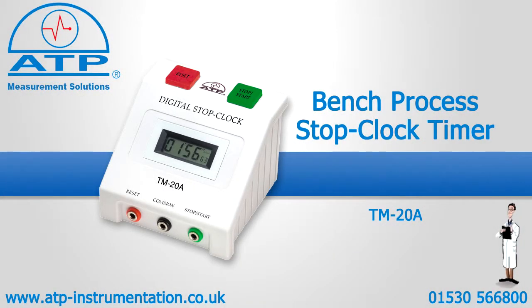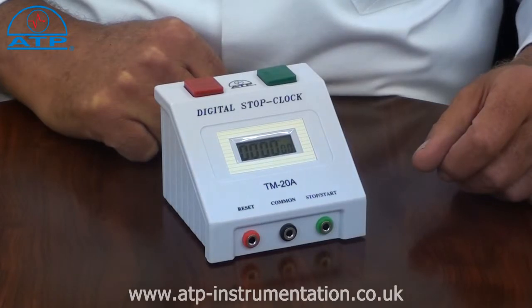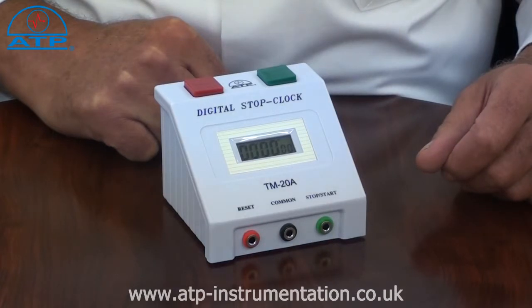An introduction to the Bench Process Stop Clock. It is supplied with a battery and instructions for use. This stop clock is shot resistant and ideal for general timing applications in sports, industry, education and laboratories etc.